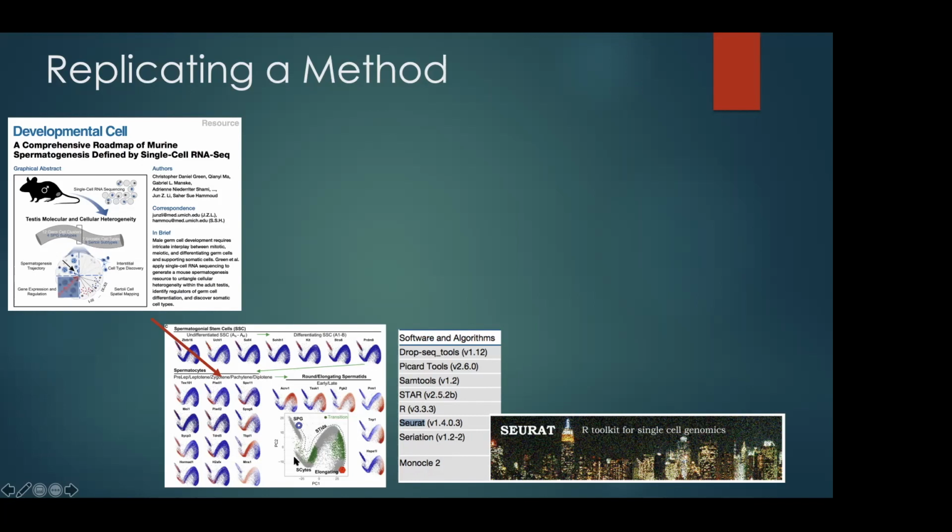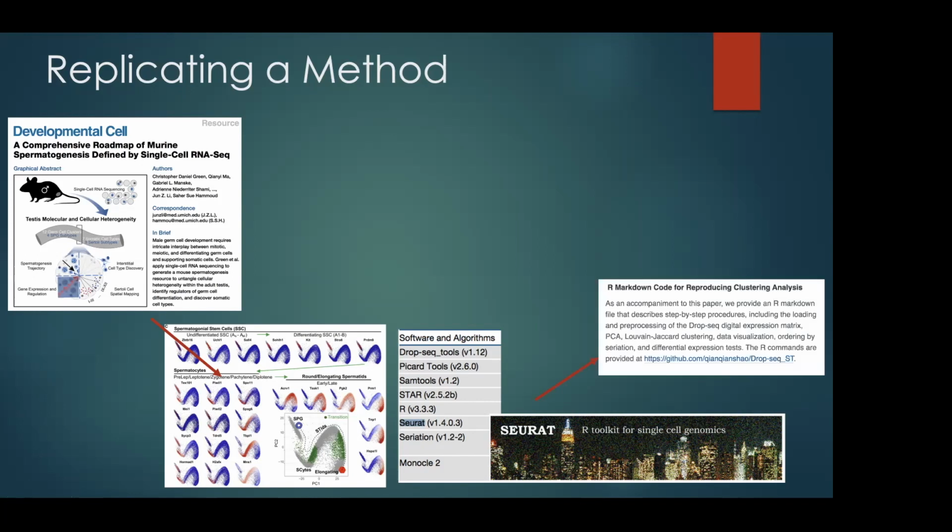But I got similar PCA plots here. Again, even if you have a good mindset to share everything you did, in the future, in a couple of years, actually less now because these tools are improving a lot, you cannot reproduce these results very quickly. It took one month for me.